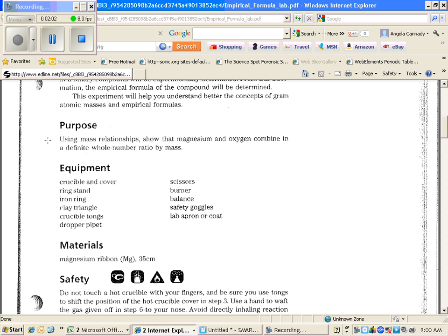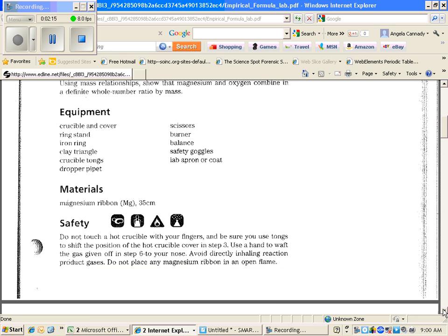That's a combustion reaction. We're going to do this in a little container called a crucible. We've not used those before this year. As we do that, it's very important that you're careful about a few things.